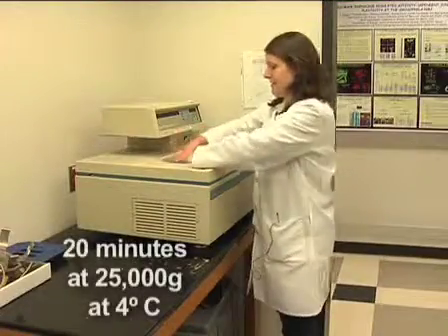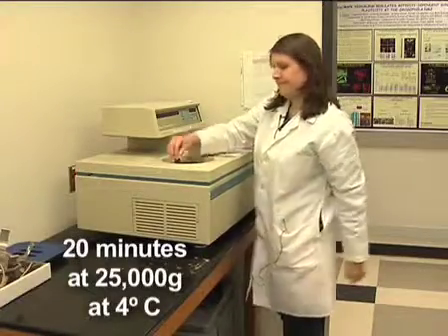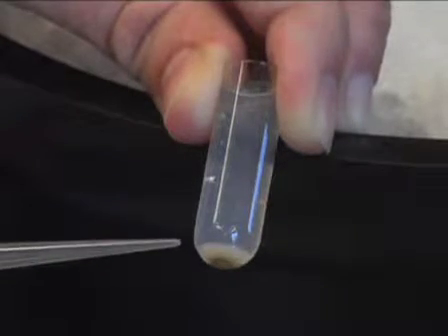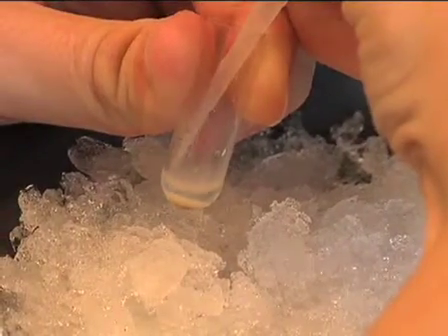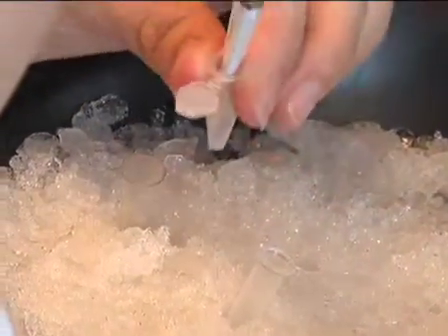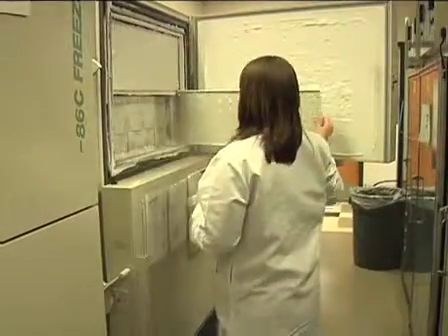Centrifuge 20 minutes at 25,000 g's in the TLS55 rotor at 4 degrees Celsius. After centrifugation, the membrane will be in a loose yellow pellet at the bottom of the tube. Pipette off the clear buffer until only the membrane fraction remains. With a wide-bore pipette tip, collect the membrane and distribute it into aliquots, then flash freeze in liquid nitrogen and store at minus 80 degrees Celsius.